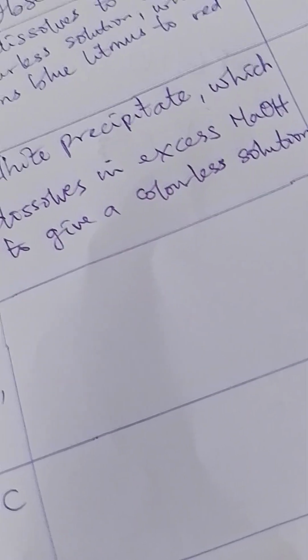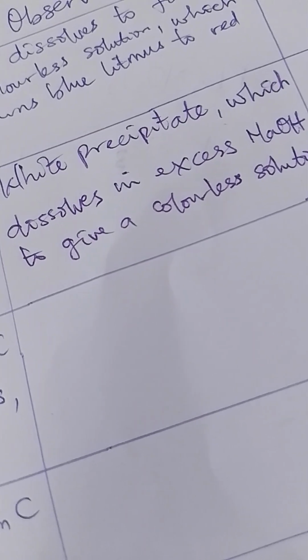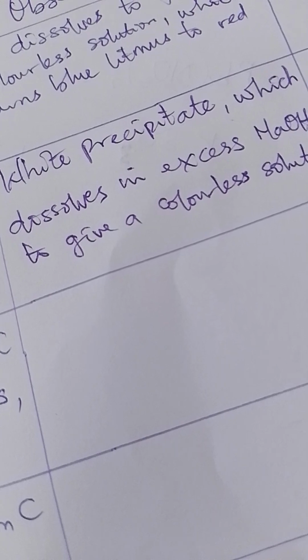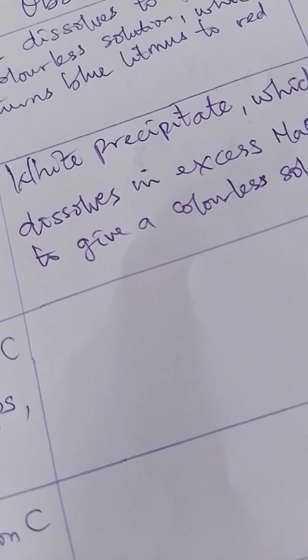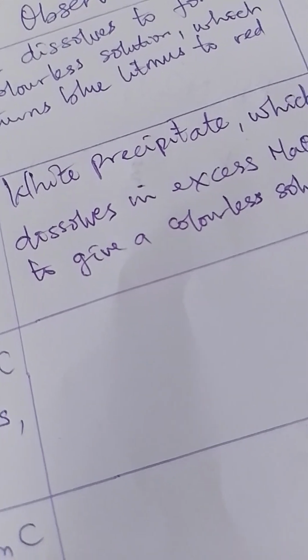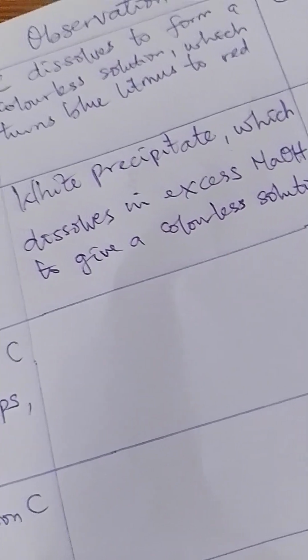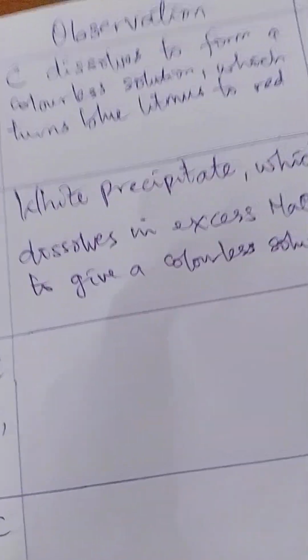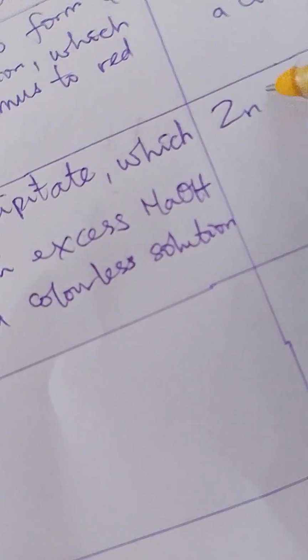There are a couple of ions that can give white precipitate. I'm not talking of gelatinous now. I'm not talking of chalky. Of course, if you look at this very well, it's chalky. If it's chalky, you pick only one. But I just want to give a broad view so that we can have an adequate reason to have our marks. So if it is white precipitate, then the ions present will be what?